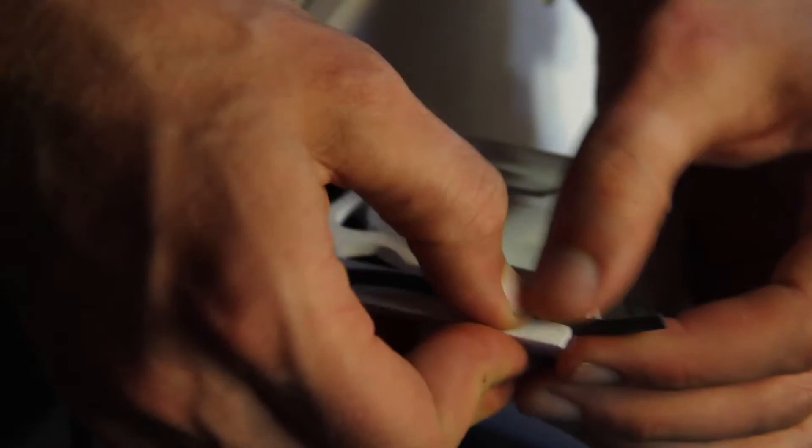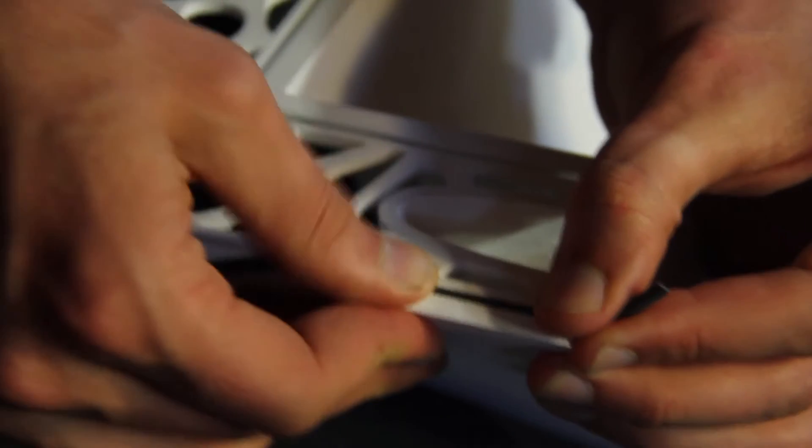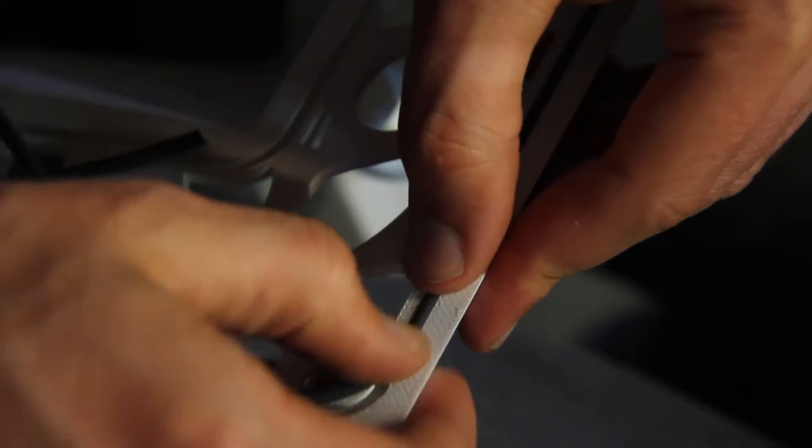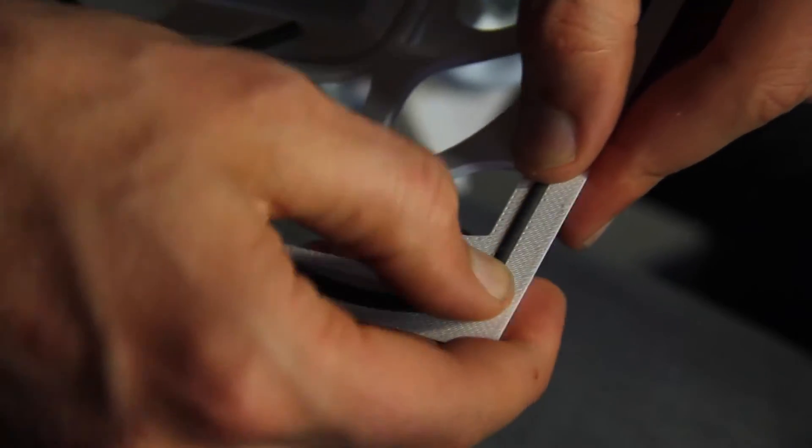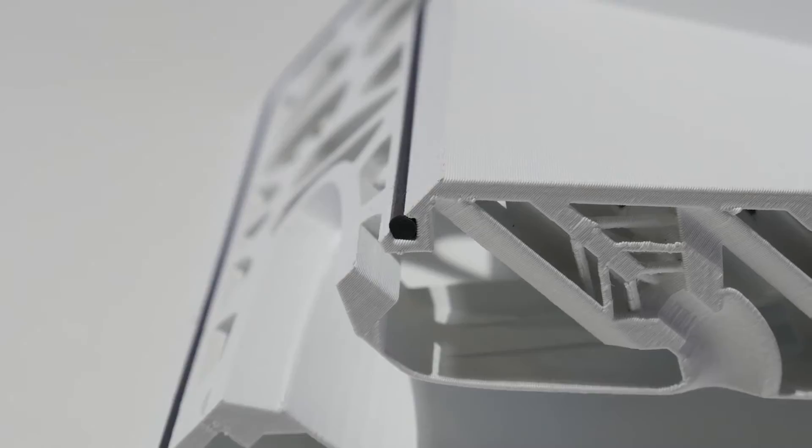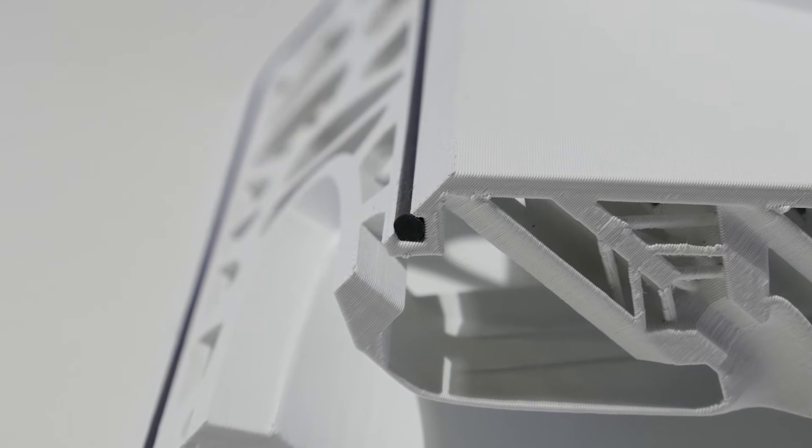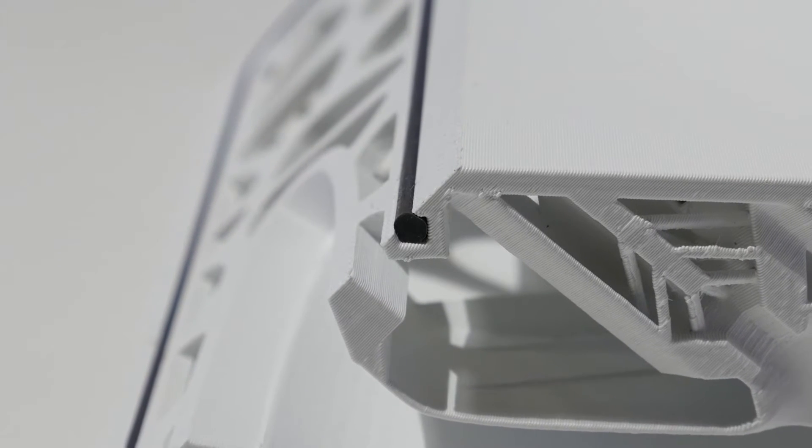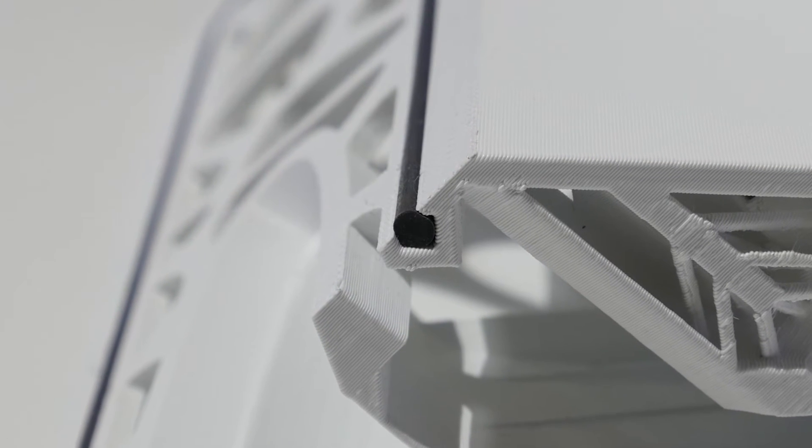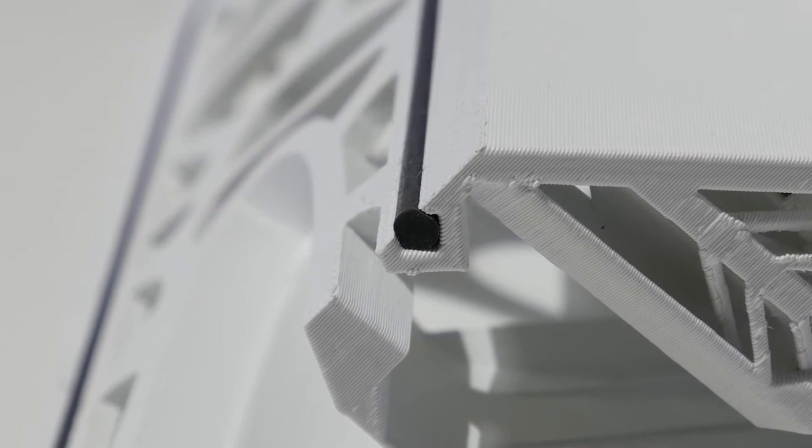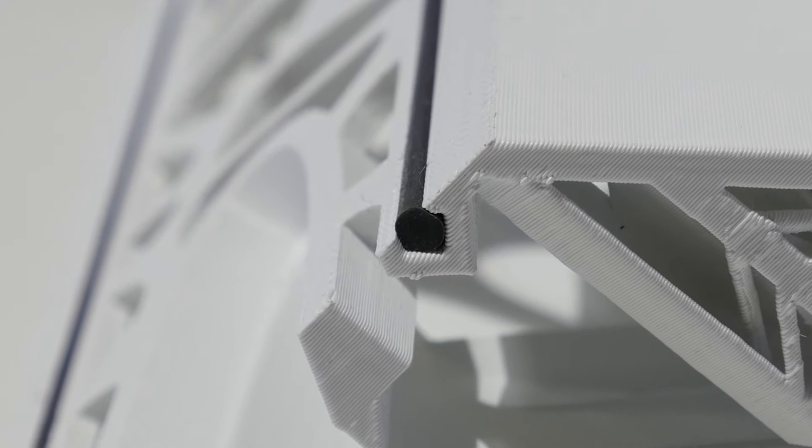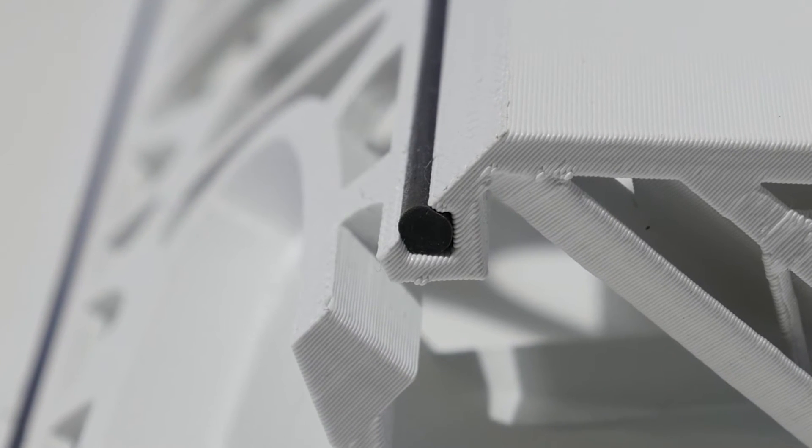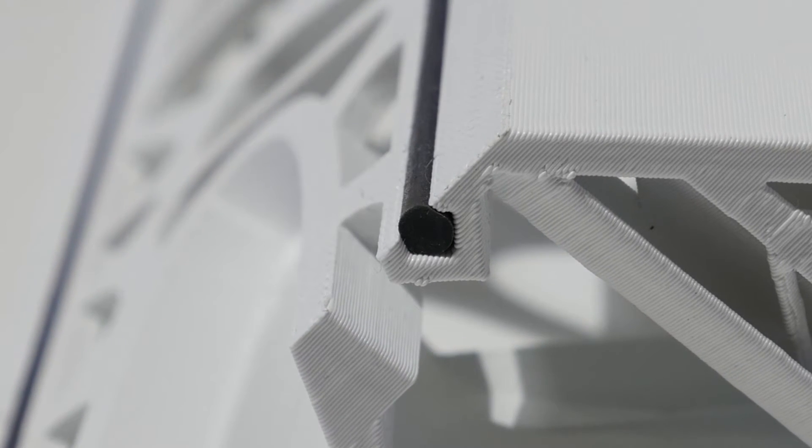The conventional approach would be to just make a very simple groove, a very simple operation in CAD software. Here we made a keyhole shape which added a lot more operations to the design, but in the end it results in a much more functional part because the O-ring now stays trapped inside and becomes much easier to service and maintain.